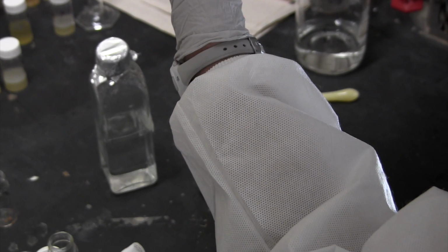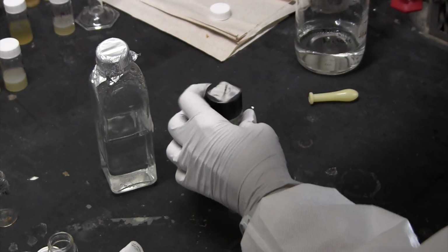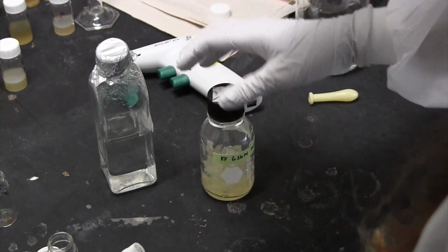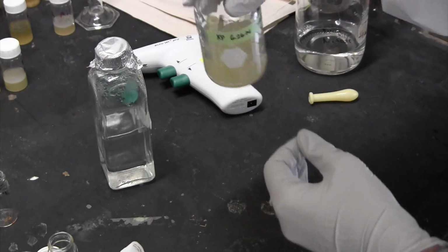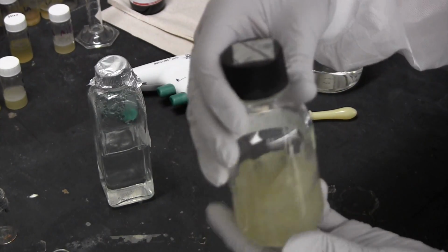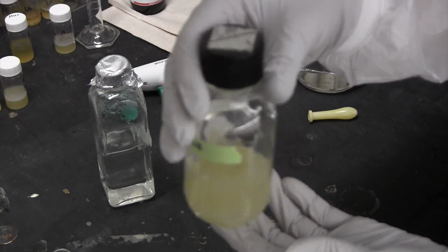You add the water right to the bottle. Okay, and now we have started to extract our samples. What you're going to do now with your bottle is put it on an orbital shaker if you have one available, and you're going to gently shake your sample. You want to be really sure that you're not doing any inversion. Again, you have solvents in this bottle.